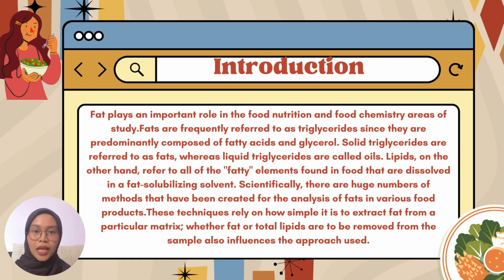fat-solubilizing solvent. Scientifically, there are huge numbers of methods that have been created for the analysis of fats in various food products. These techniques rely on how simple it is to extract fat from particular matrices. Whether fat or total lipids are to be removed from the sample also influences the approach used.